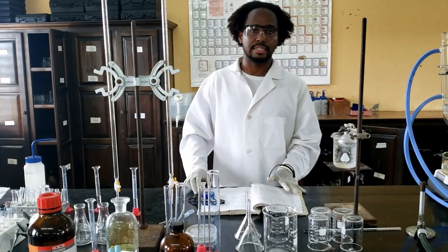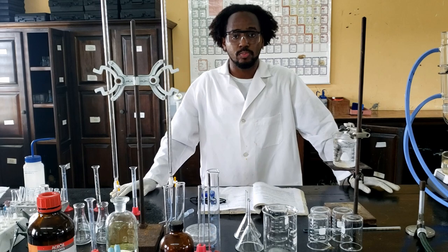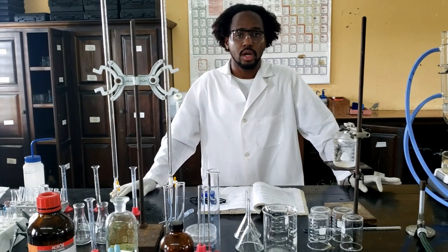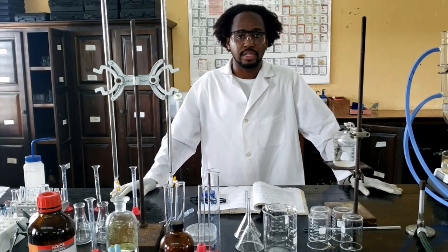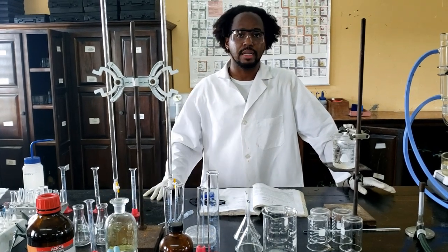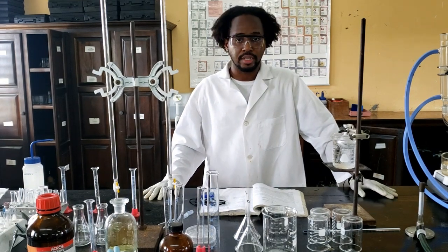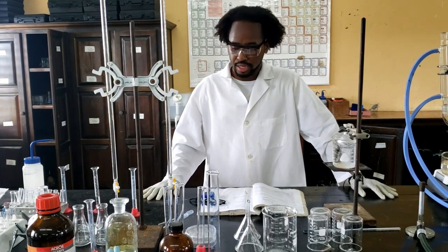I've already gone ahead and set up the majority of the apparatus. Normally we do this lab in a two-part series, so students would work about 3 hours on the first lab session and then another 2 hours on the second lab session. So I might end up doing this video in a two-part series. The first part is the nitration reaction.